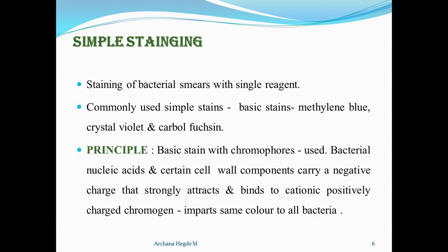Coming to the principle, basic stains with chromophores are used, which have the property to attract bacteria. If they are positively charged, they attract negatively charged bacteria. Bacterial nucleic acid and certain cell wall components carry a negative charge that strongly attracts and binds to the cationic, positively charged chromophore, imparting the same color to all the bacteria where it is attracted.